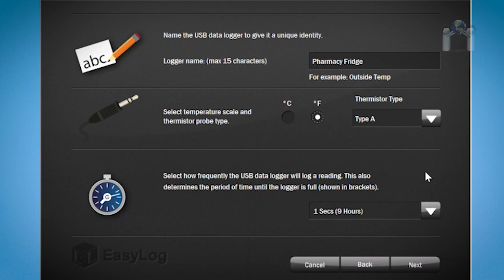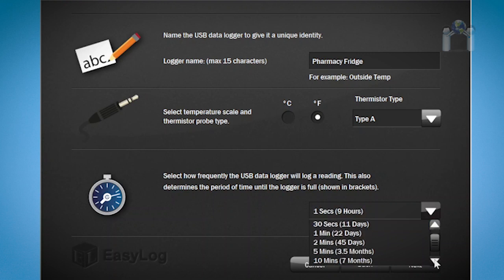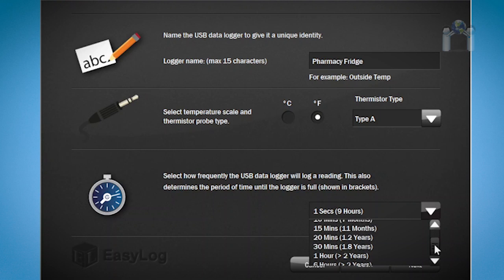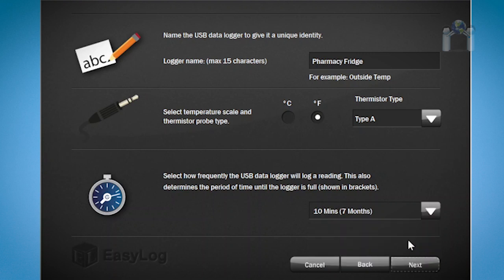The third option is how often you want the data logger to log the temperature. The more frequent, the faster the memory fills up. The software conveniently shows you how long it will take to fill the logger's memory based on frequency. Click the drop-down box and make a selection. For this demonstration, I will select 10 minutes, then click on Next.